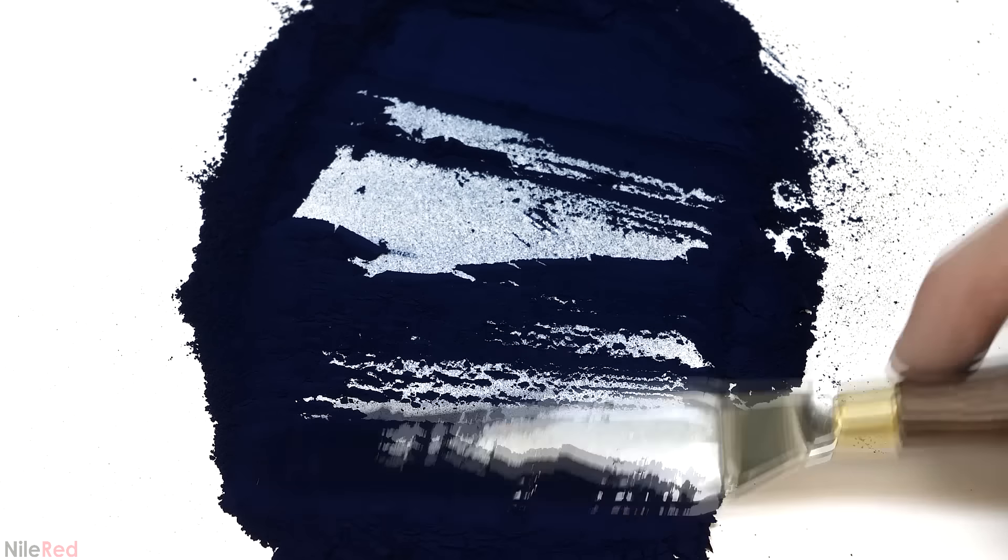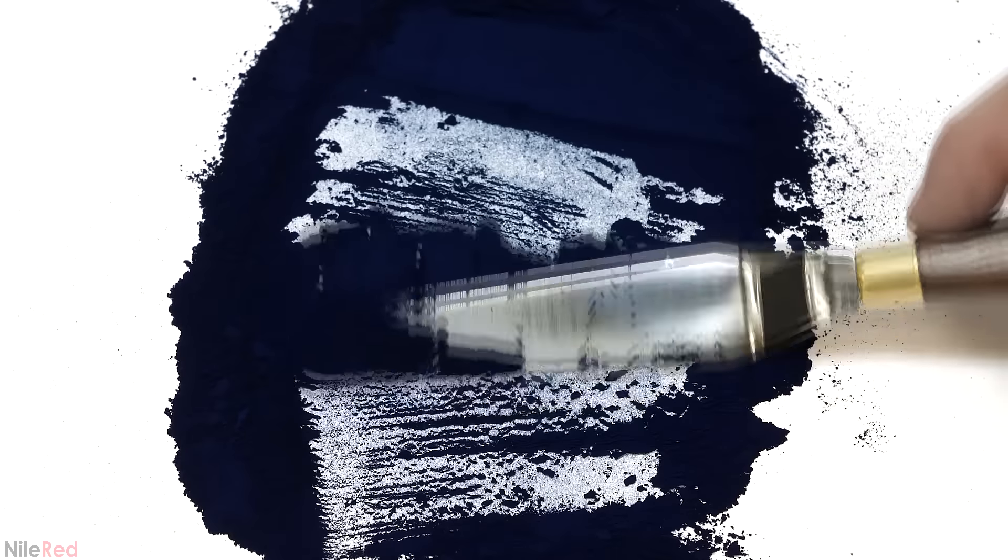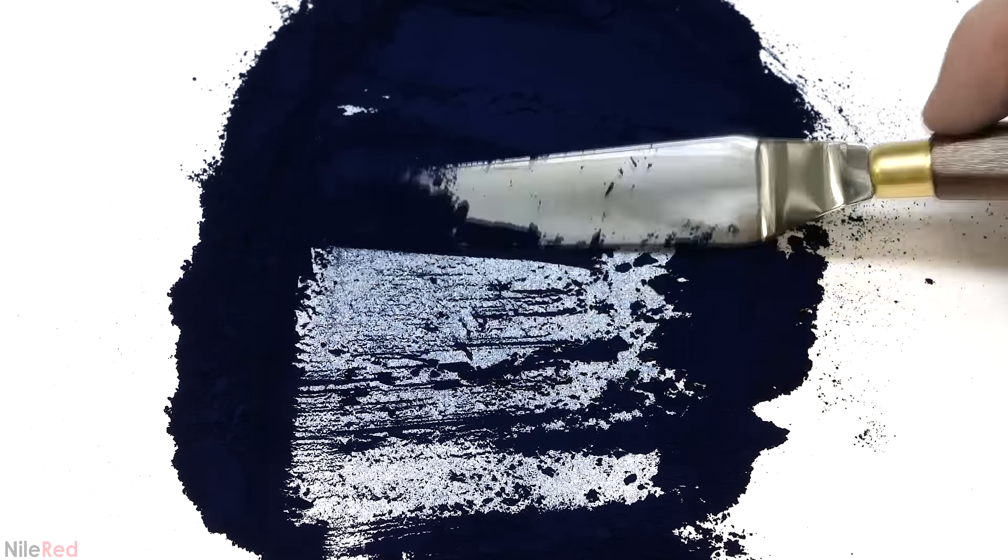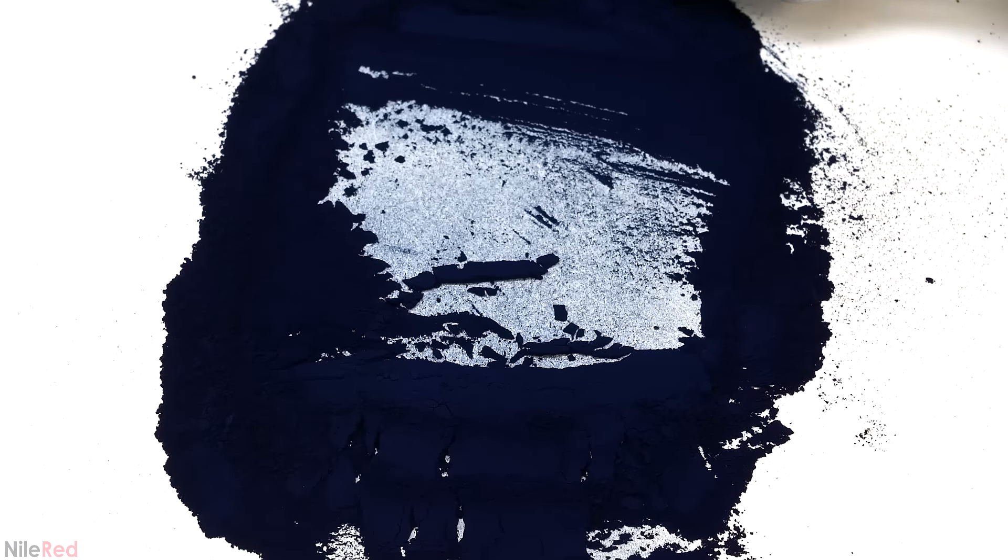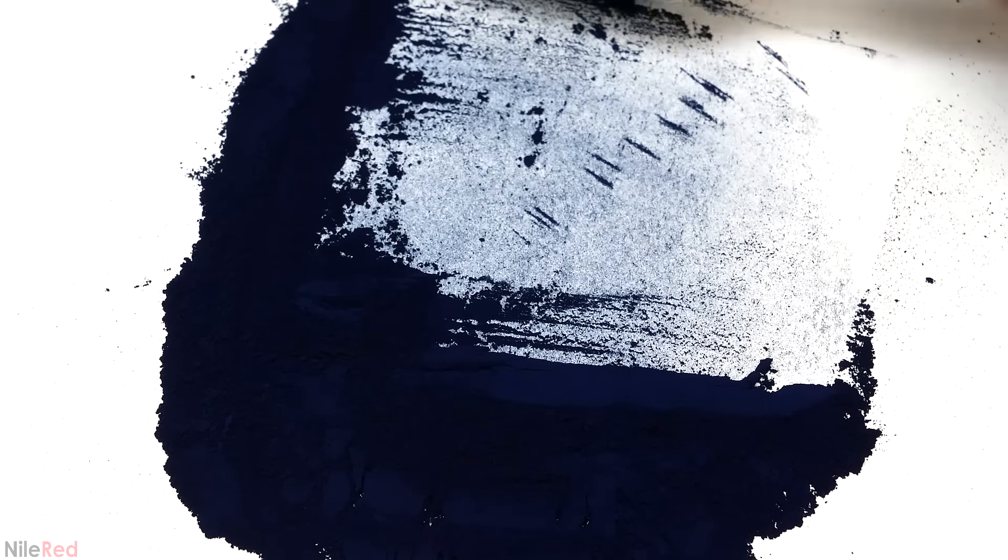In a previous video I made some nice Prussian blue pigment and showed how it can be used to color things like paint. This time though, I'm going to be exploring a more specialized use for it, which is in a process called cyanotype.